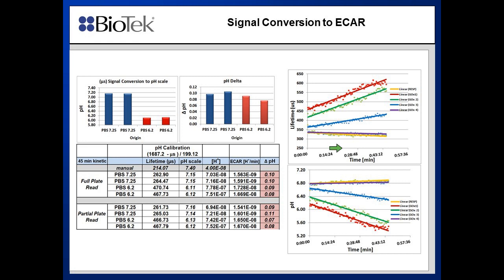Yeah, I'm just going to answer this last question here. It says the arrow of pH is going up. You mean the acidification. This is the pH here. These levels are going down, which means acidification is increasing, and the probe signal is going up in parallel to that. So this is the signal, and this is the pH. Perfect.